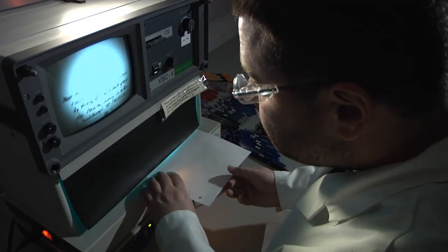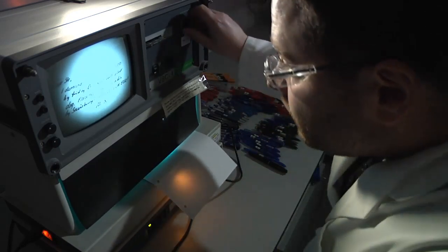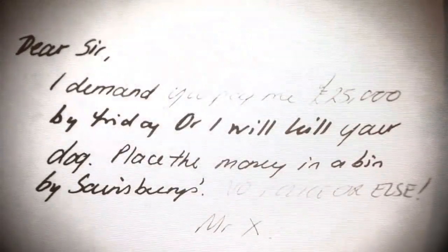The next test would be to place the ink on the document under infrared and ultraviolet light using a special piece of equipment called a video spectral comparator, or VSC for short. Under these special lights, the inks may fluoresce or glow.